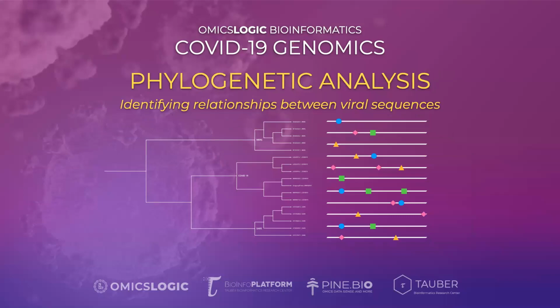Then we'll talk about phylogenetic analysis. How can we compare sequences and understand their relationships? How are they related to each other? Or how are they different and potentially have common origins? So that's called phylogenetic analysis.